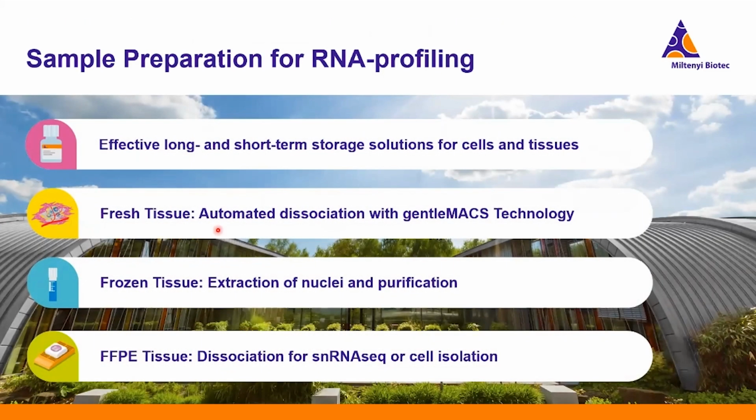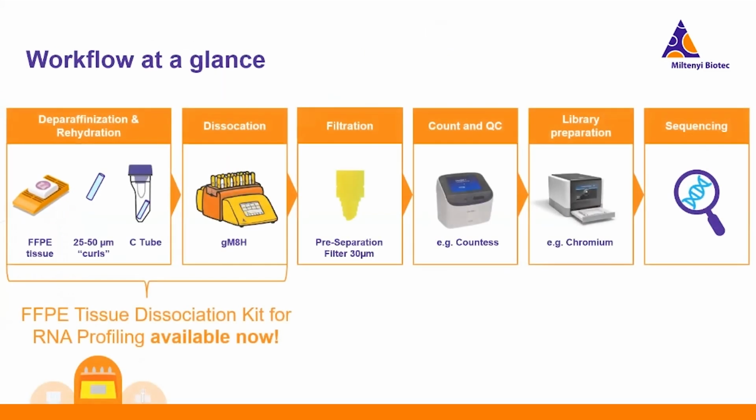So coming to the last topic for today, FFPE tissues. Also here, I want to first of all give you a brief overview of the whole workflow.